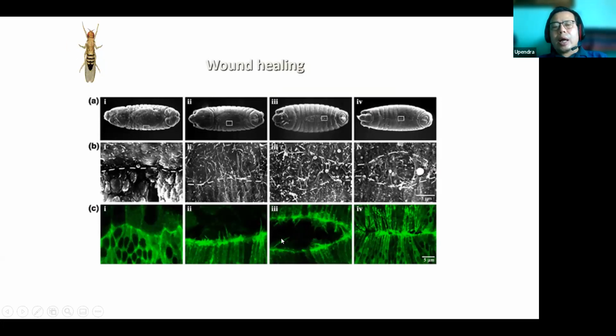These cells come zipping together, and it is used as a wound healing model. It works just like when you have an injury, right? Now the question is, what are the molecules which come near to this? This is what we are trying to study, and this again can be studied by live cell imaging, but most of the live cell imaging, as I told you, has been 2D.